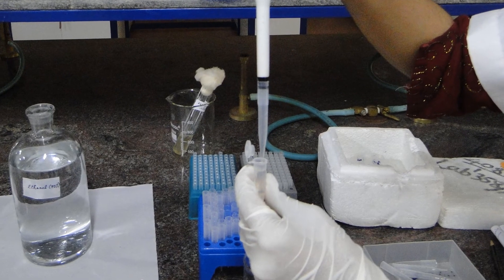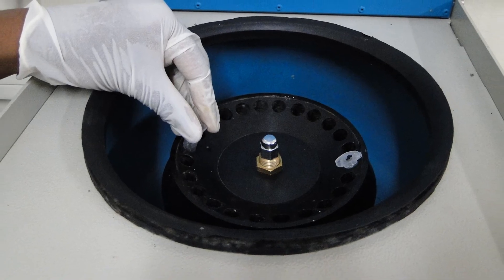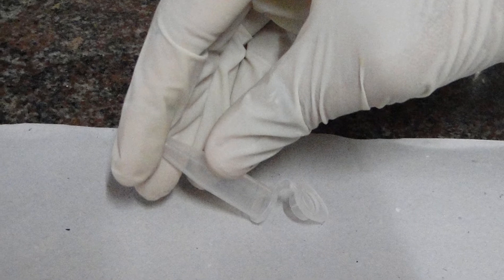Add 1 ml of 70% ethanol to the pellet and centrifuge it for 2 minutes. Remove the supernatant again and allow evaporation of the ethanol from the vial.